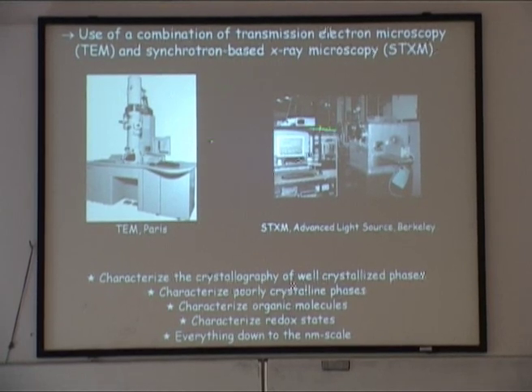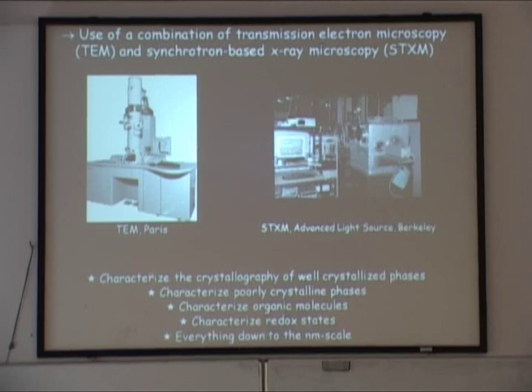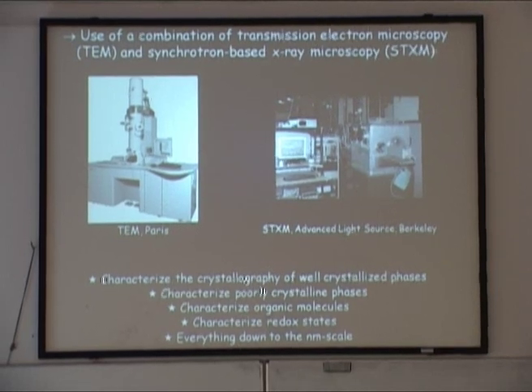So these will be the two main techniques I will talk about. So transmission electron microscopy, which is probably more known by the community. And that one, this is synchrotron-based X-ray microscopy, or STXM.